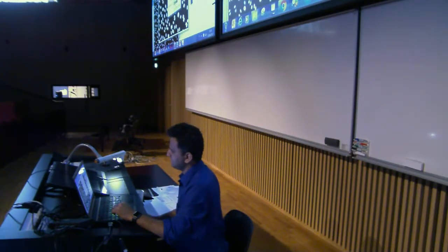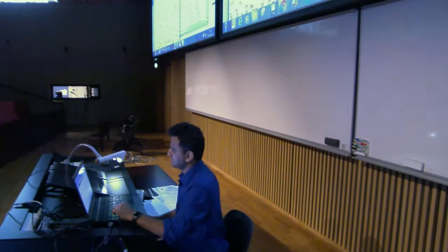So I want to apply it on the nuclei1.tif. That's my raw data, right? And that's it. So you just hit OK. And now you go back again, go to analyze particles, and now all the information that you're going to extract is based on the intensity. You see here now, every nucleus has got an intensity from the raw data.